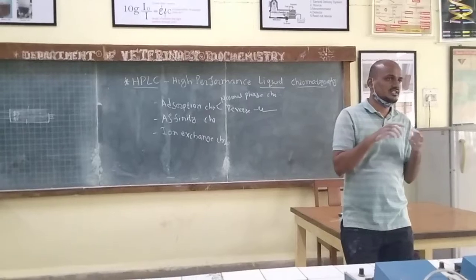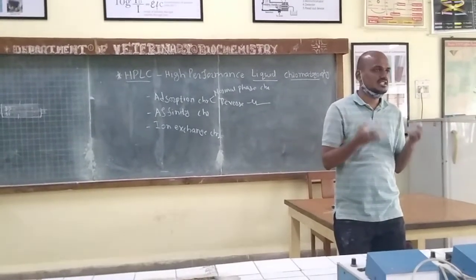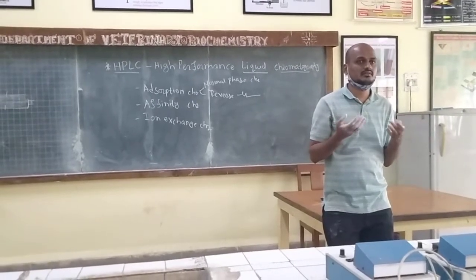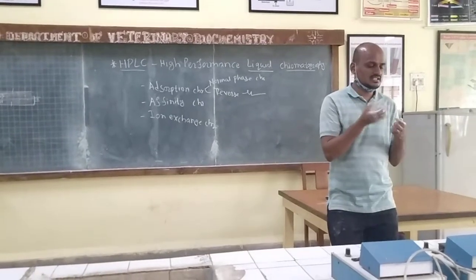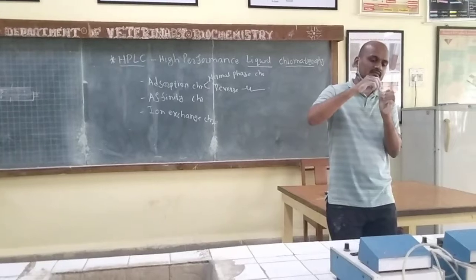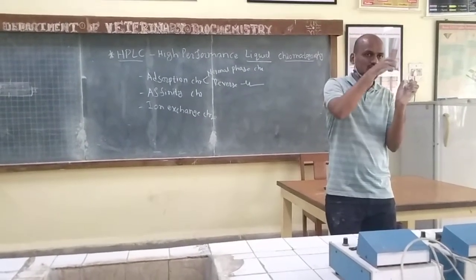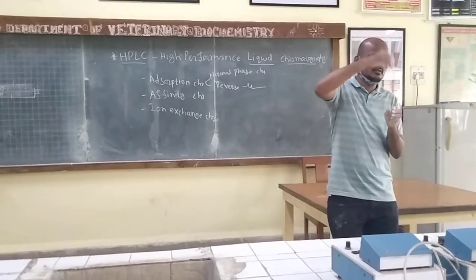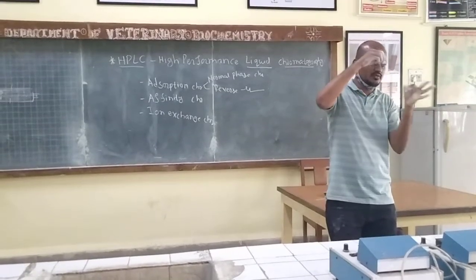So after centrifugation, what will happen? The bacteria after lysis will all be lysed, right? What is our motive? We want the DNA or plasmid, for example, plasmid from that bacteria. So we take this supernatant and put the supernatant on this column. Here is the opening. It will go through it. So we centrifuge it. After centrifugation, it will come into the bottom tube.